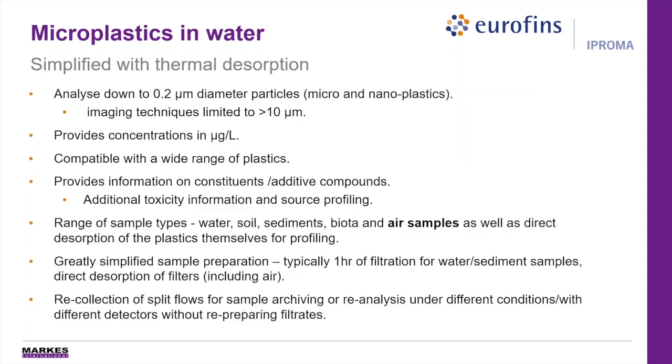So, with thermal desorption, we're able to analyze down to 0.2 micron diameter particles. So this isn't just the microplastics, it's also the nanoplastics, which are now emerging to be of interest as well. It's quite common for imaging techniques to be used for this type of analysis, but they can only measure down to 10 microns. The technique provides concentrations in micrograms per litre, so you can really see what mass of plastic is present in your sample.